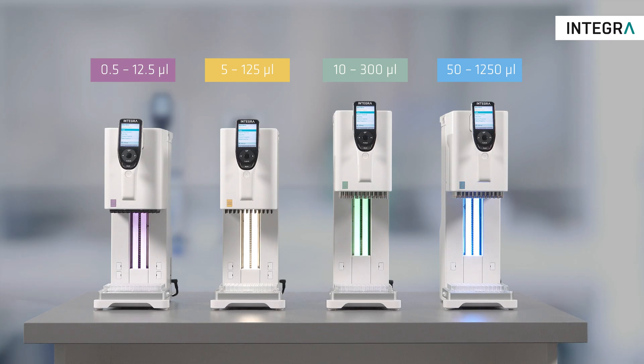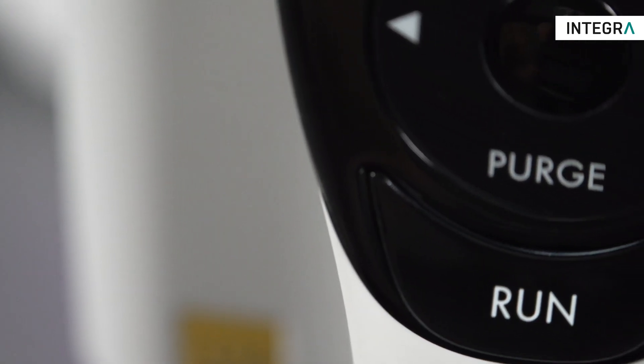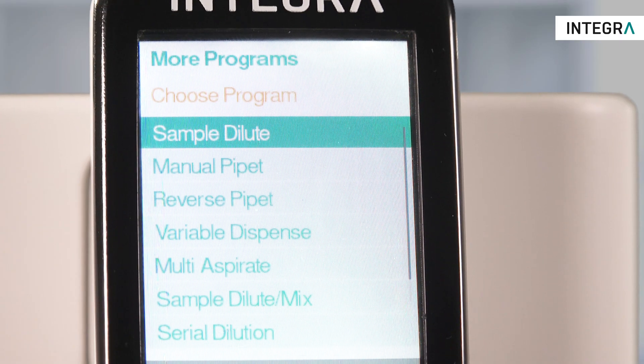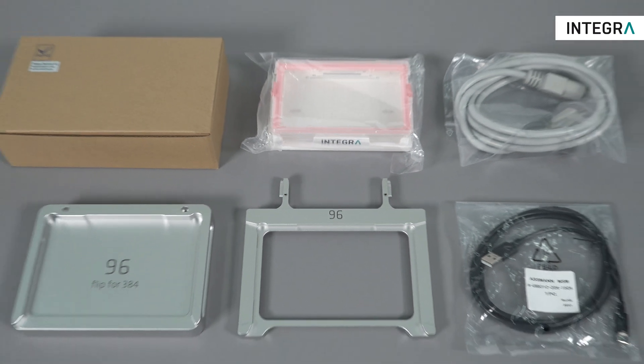This video will teach you exactly how to use your MINI 96. After opening the packaging, the accessories box can be removed and contains everything you need to start pipetting with the instrument.